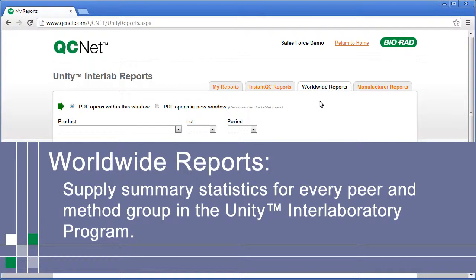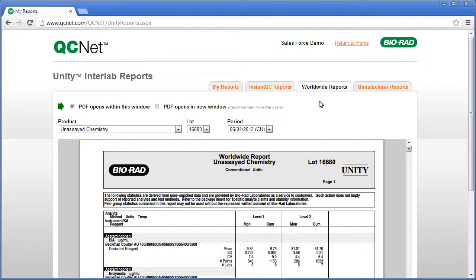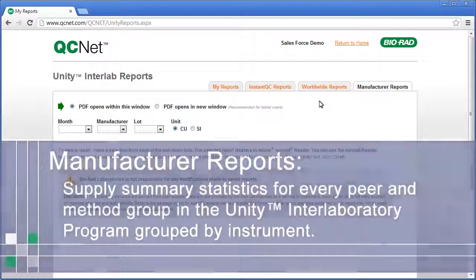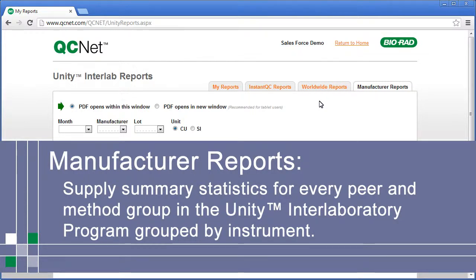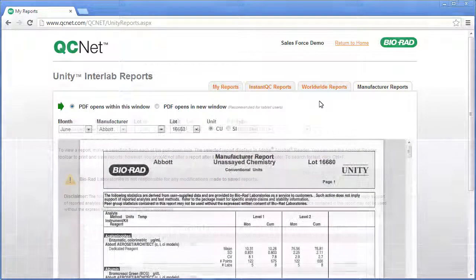Finally, Manufacture Reports supply summary statistics for every peer and method group in the Unity Interlaboratory Program, grouped by instrument. The Manufacture Report is a good reference when evaluating a new instrument, kit, or method.